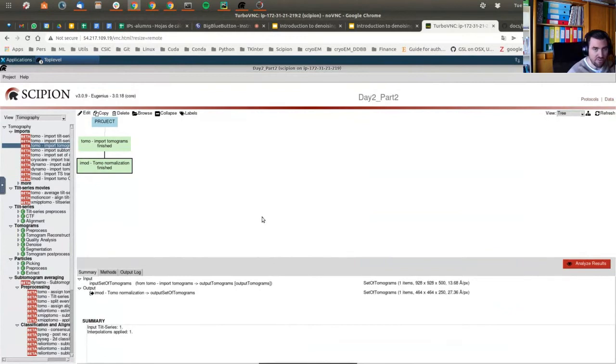Now, the IMOD viewer is a little slow. The tomogram is thick, but I don't consider it so big, but in these machines some things are slow. Yes, I completely agree with you, Bram, about the normalization step. I'm not sure about the hard disk of these machines, but I'm afraid it's maybe not an SSD, so the writing and reading velocity is not as fast as we are used to. For a third time, I agree with you, Bram.